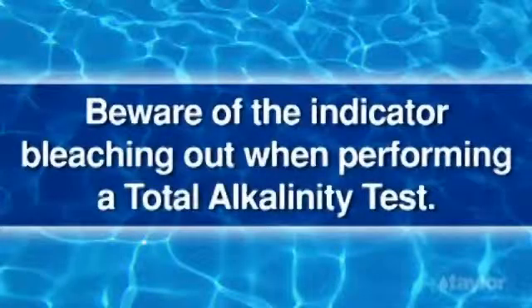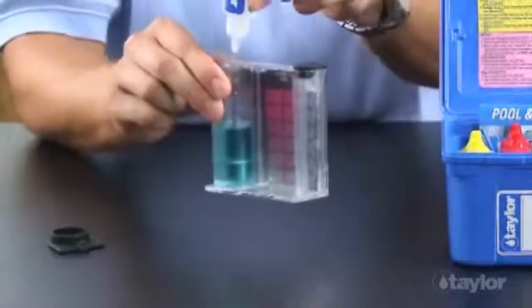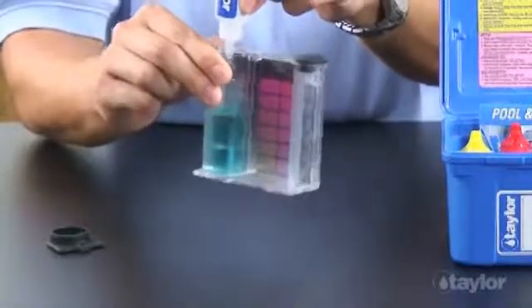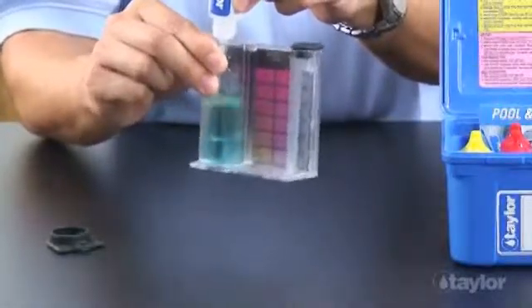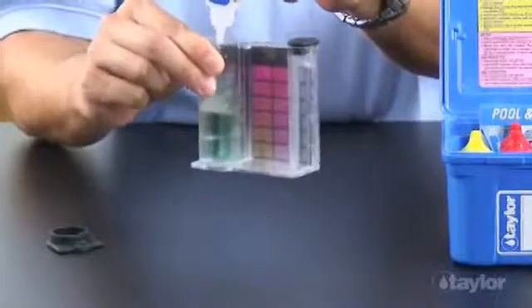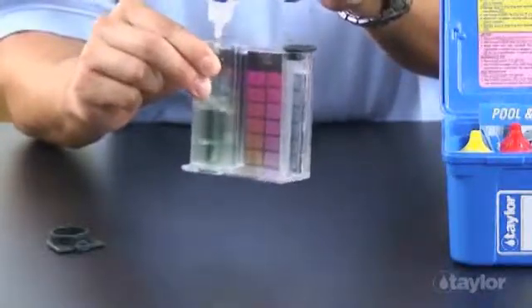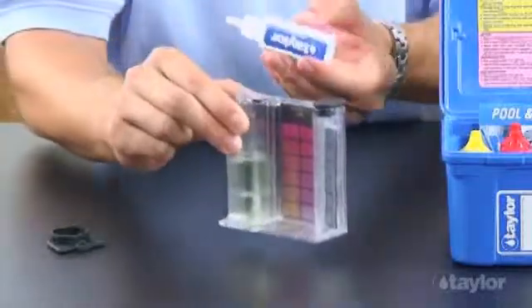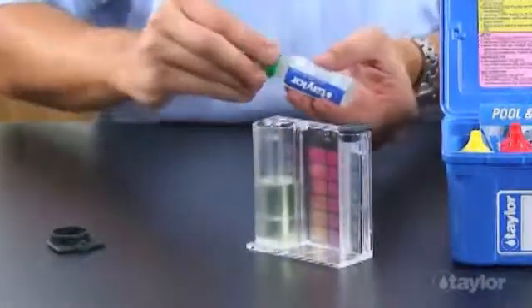Beware of the indicator bleaching out when performing a total alkalinity test. The most common interference is caused by a high level of chlorine or bromine. If excessive chlorine or bromine is present in the sample, one of the two organic dyes used in the total alkalinity indicator bleaches out. When this happens, the reaction's color changes from blue to yellow instead of green to red.